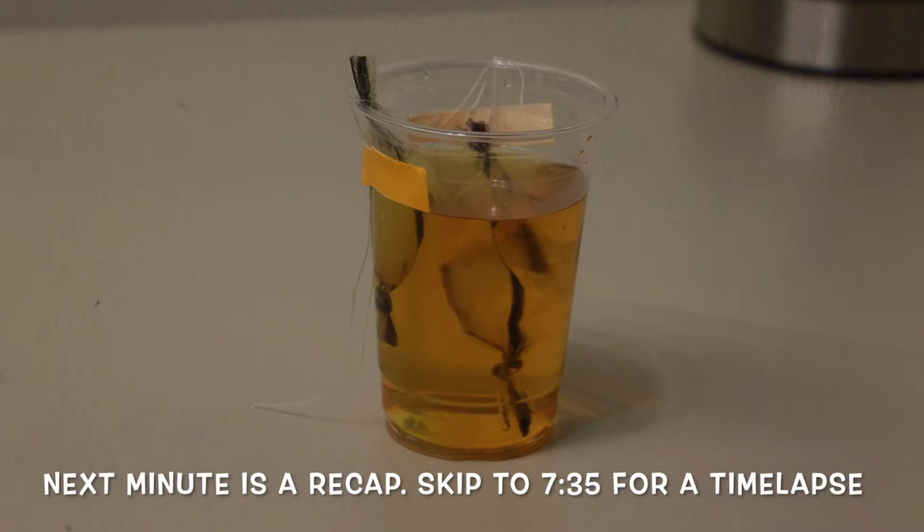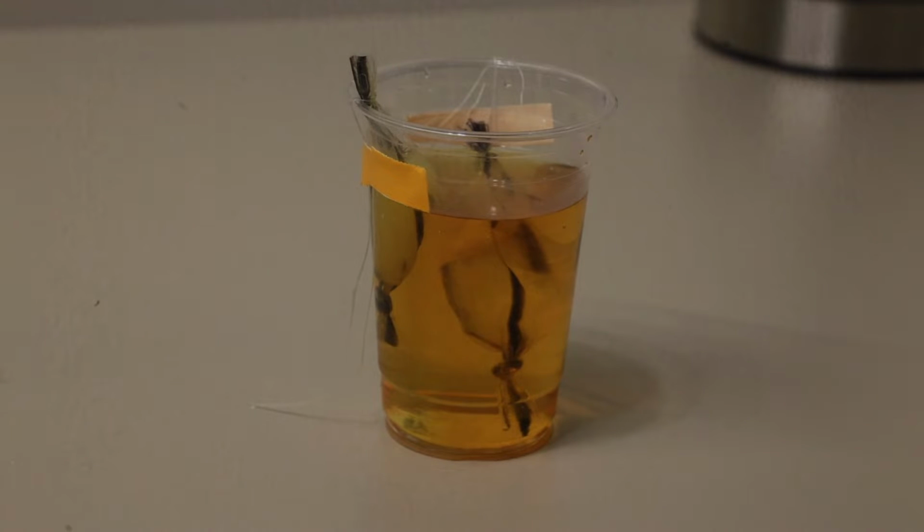Remember, what color does iodine turn in the presence of starch? You should be seeing a blue color, so we're watching it to see if anything turns blue. So as we watch the iodine starch solution, we want to ask ourselves, which contents are moving through the cell membrane? The options that we have are starch, glucose, water, and iodine. A semi-permeable membrane can transfer smaller molecules.